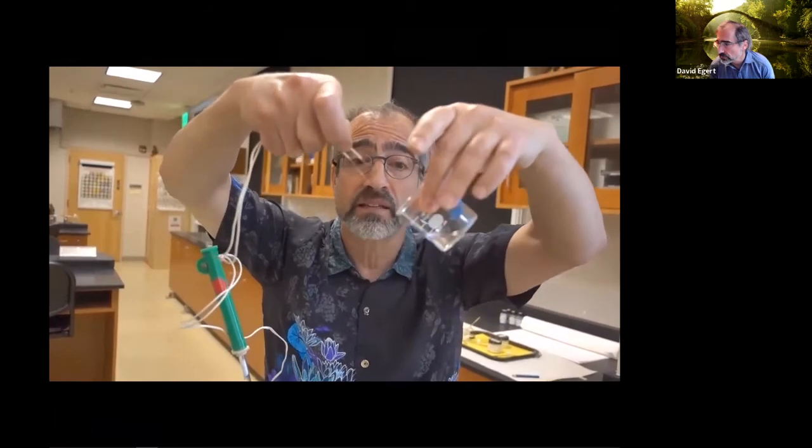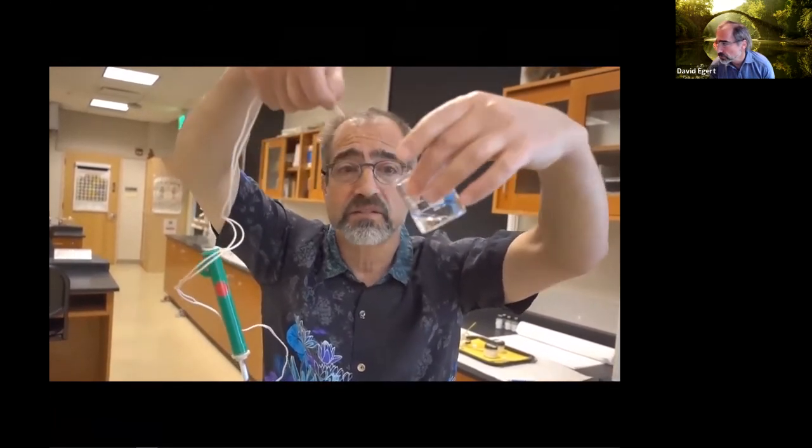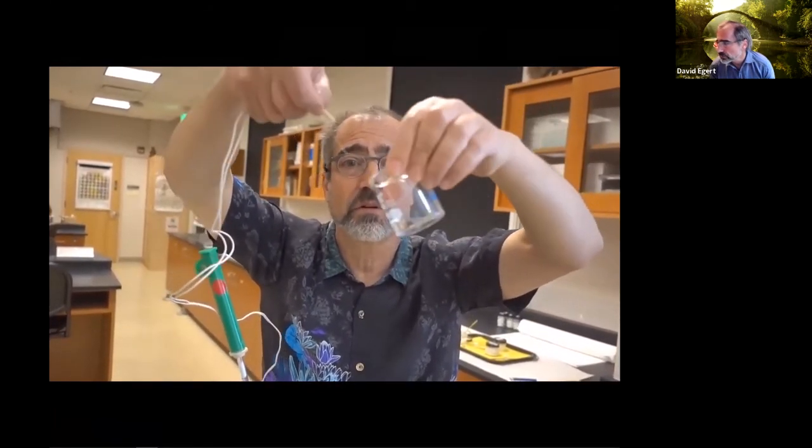But here, I'm going to take these. I'm going to put them in. This right here is the calcium chloride. Let's see what happens.